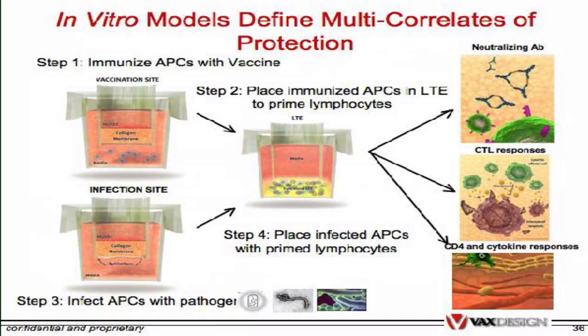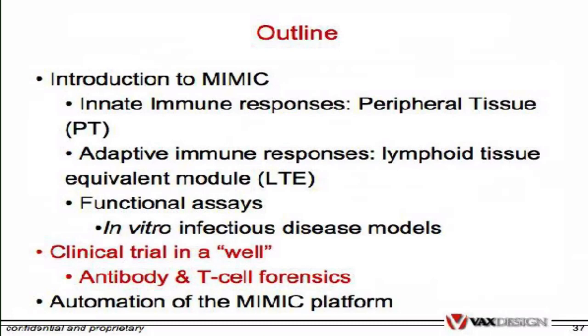The ultimate readouts that we have are neutralizing antibody, CTL responses, and certainly cytokine and CD4 T helper cell responses in our system.